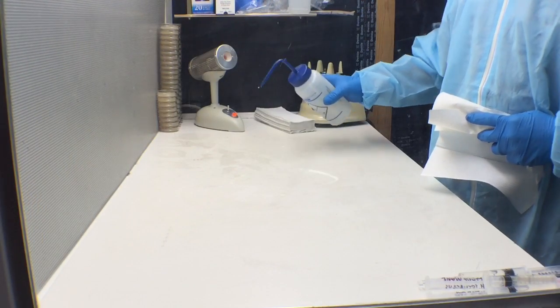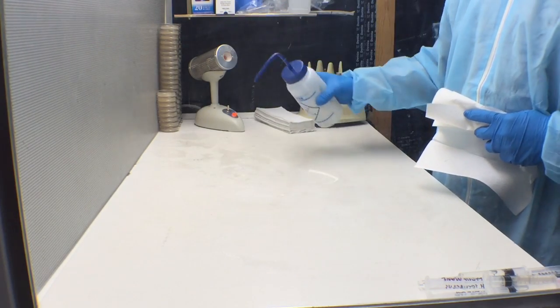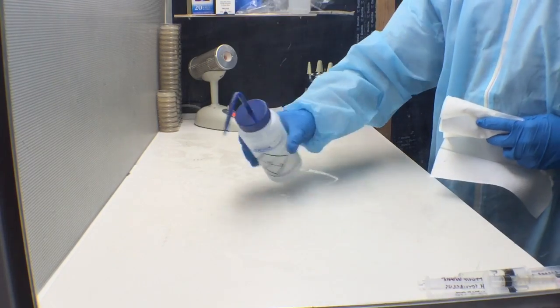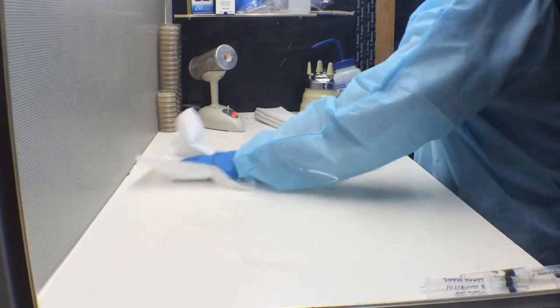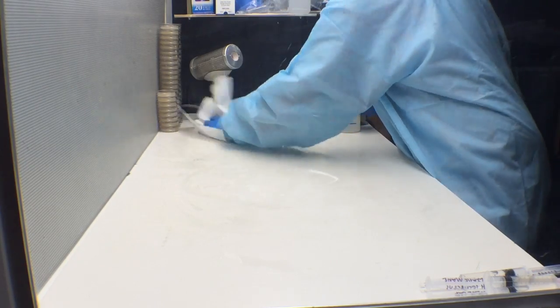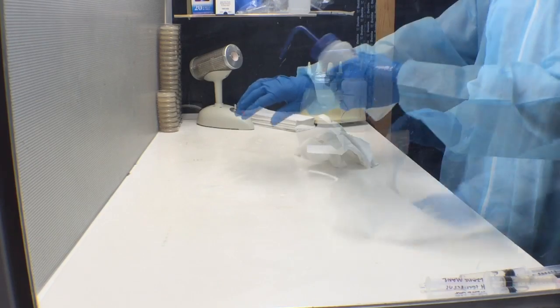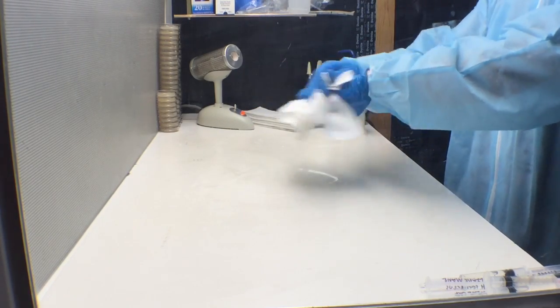The first thing you want to do is make sure your working space is sterile and free of contaminants. We're going to spray everything down with alcohol and wipe everything down. Make sure to keep your hands clean at all times.